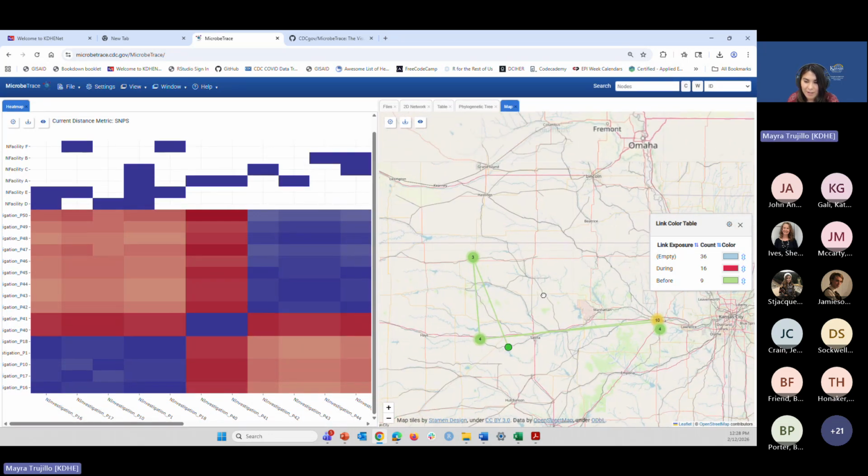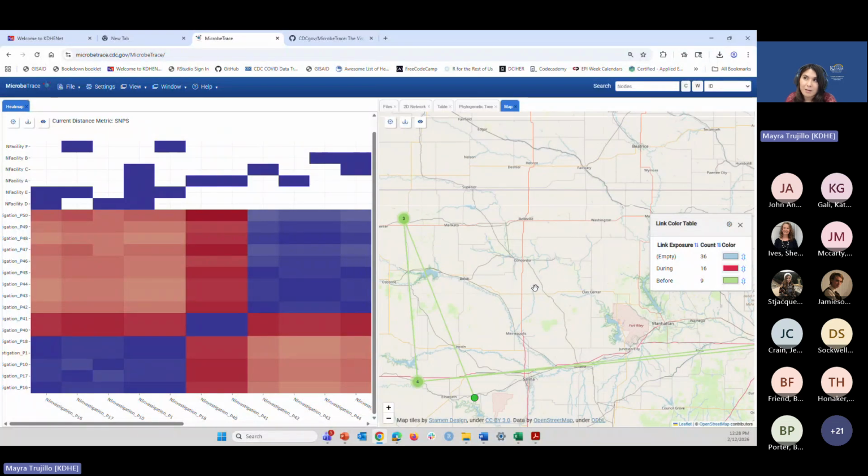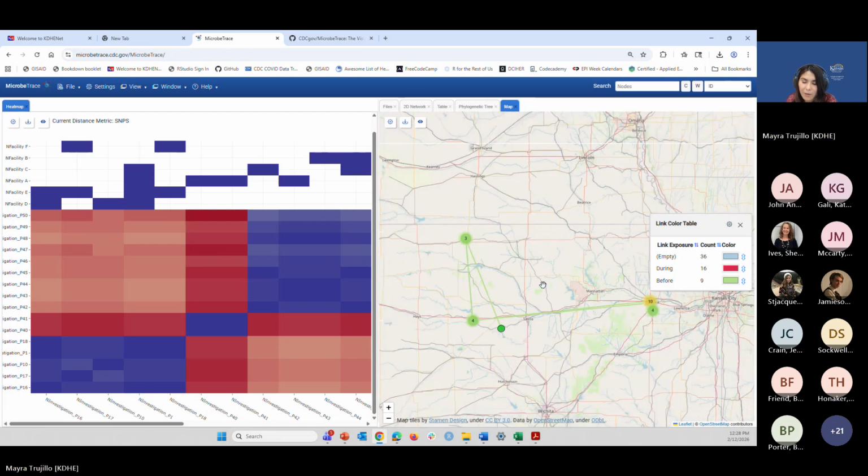So for these outbreak investigations, especially for carbapenem-resistant organisms, especially when the cases usually take place at long-term care facilities, hospitals, everything is kind of one in location. So it doesn't give a lot of information, but let's say that you were investigating like COVID outbreaks or measles outbreaks, this would probably serve better in those outbreaks rather than these carbapenem-resistant organisms outbreaks.